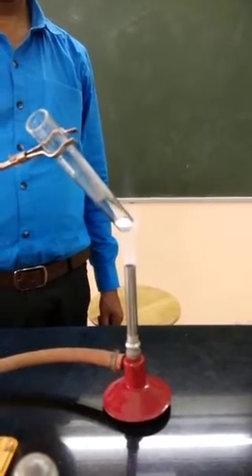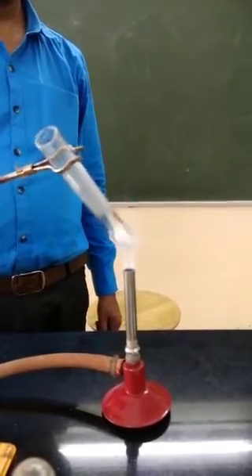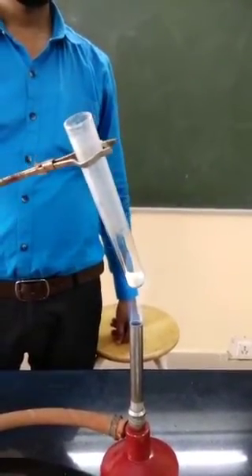On heating strongly, this amorphous white solid changes to pale yellow. This compound gives off a colorless, odorless gas which, when passed through lime water, will turn lime water milky.